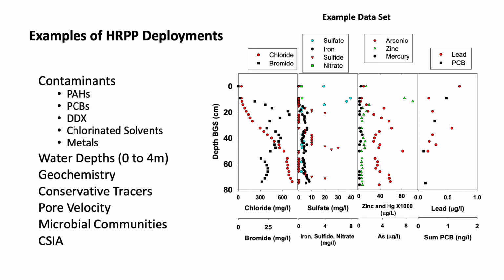So the preceding slides covered the assembly, deployment, and sampling of the HRPP samplers. Again, there is more detail in the YouTube video. While this presentation is not designed to cover the demonstrations and the results that were obtained from the various deployments, I did want to at least give you a short preview of the type of data that is collected by these samplers.